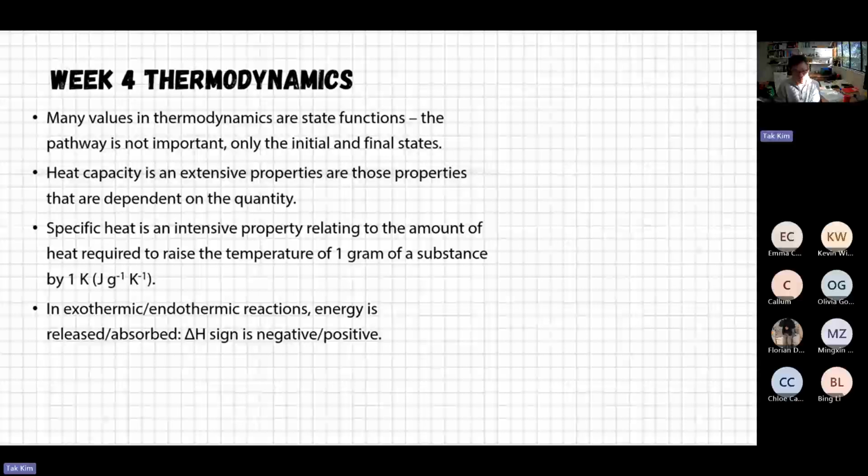Okay, and most importantly, not all of you, but some of you might have some misunderstanding, because by doing the calculation, you expect to have negative values, but it is not true. The values you are using are all positive. So you wouldn't be able to get any negative values unless you made a catastrophic mistake during your experiment.